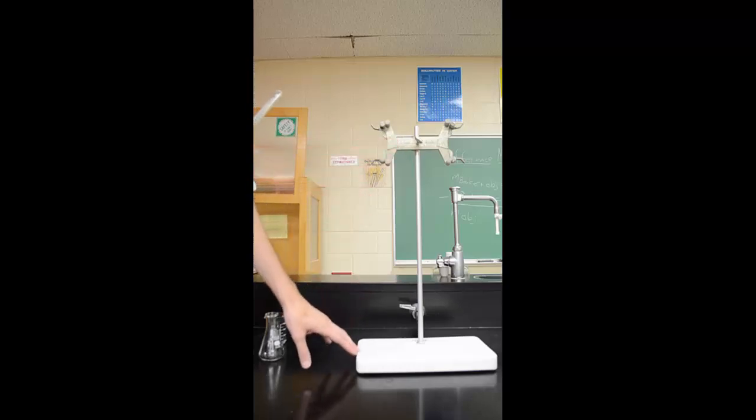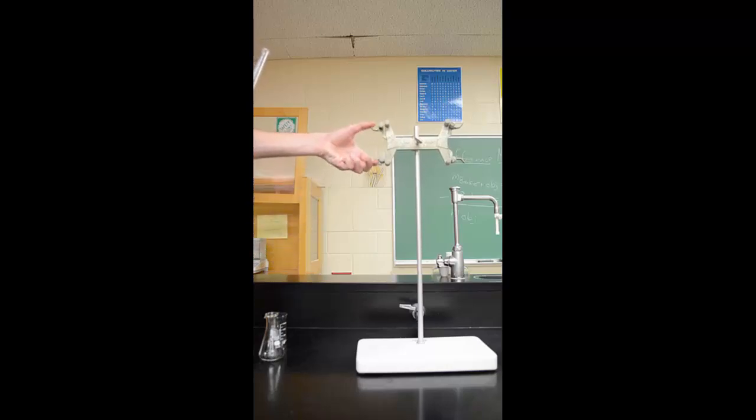First of all, we need a stand. These are around the lab, so make sure you grab one. The stand has a clamp on both sides, but we're just going to use one side. You take the burette, put it into the grooves, and then let go. It's held in just by the pressure of those springs.